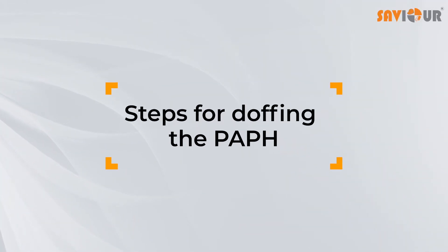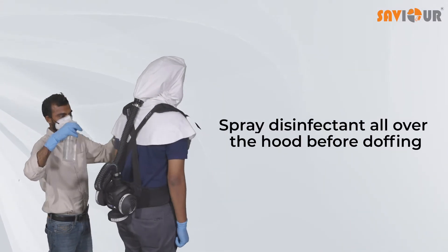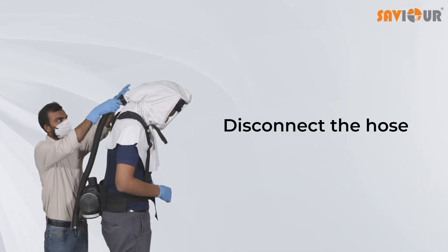Now, for doffing the PAPH: have an assistant spray disinfectant all over the hood before doffing. Then disconnect the hose from the input air connector.